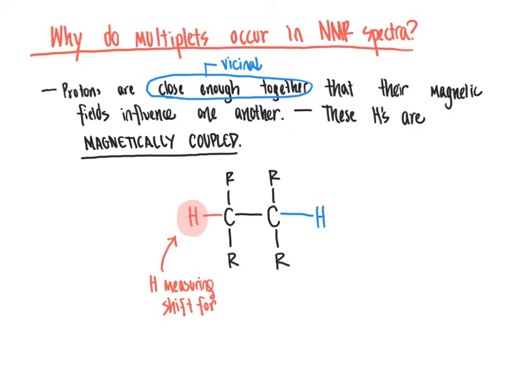Thinking about the multiplicity pattern that would be observed for the red proton, remember that the blue proton it is coupled with would have two spin states.